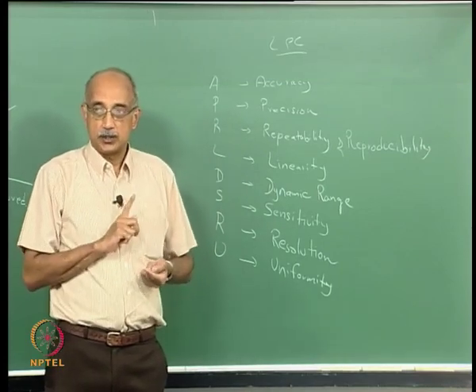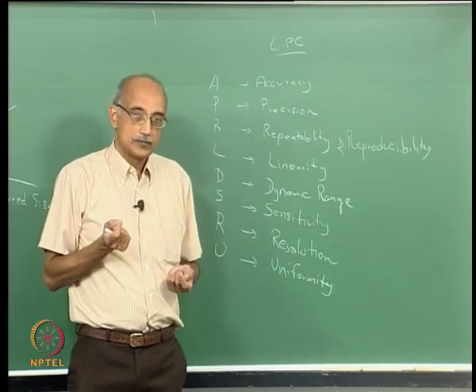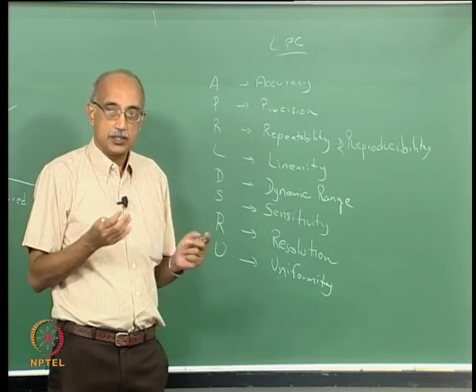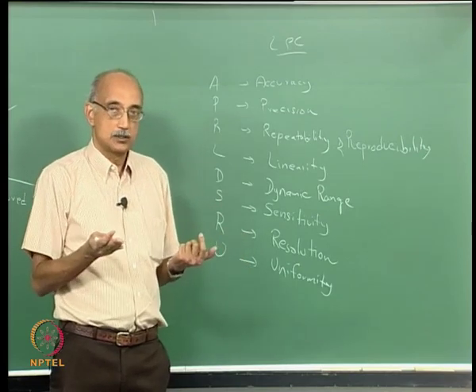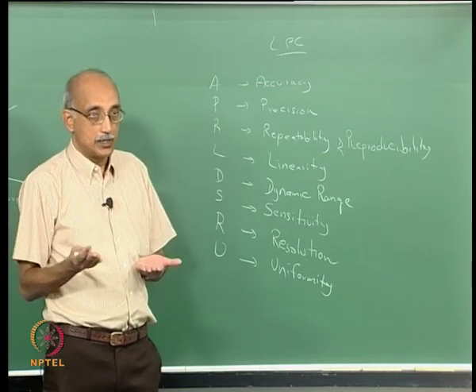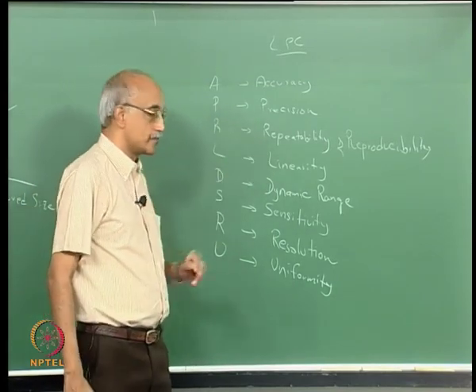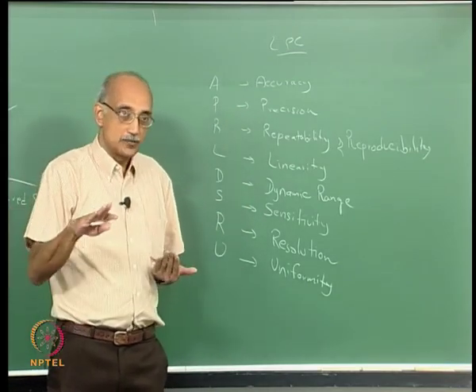They may be different. In fact, in particle counting and size analysis, we will frequently notice that the error in the measurement actually increases as the concentration of particles changes. Some techniques such as light scattering work better on more dilute samples. Other techniques which we will discuss later on, such as acoustic scattering, actually work better when you have a greater concentration of particles in the sample. So you would not expect that accuracy, precision and repeatability, reproducibility will remain constant over the entire range of measurements.